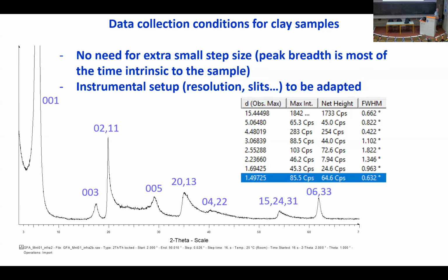And as to the opening of your slits, I wouldn't do that for every sample, but something I would recommend is, from some typical samples you have, just to play with that at first, which means go from a very small opening and so very low intensity, and increase that, and see at which point you think you may see a very clear broadening due to the instrument.